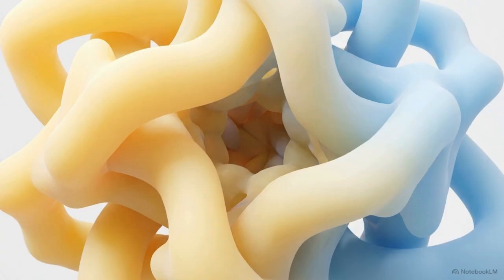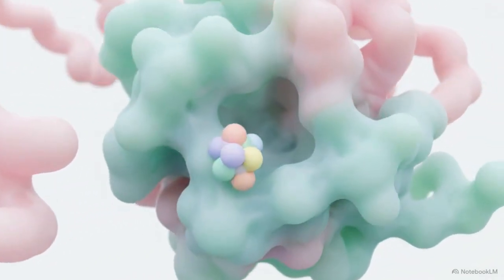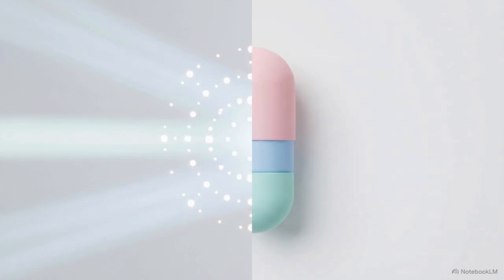By understanding the exact atomic layout of a protein, we can design synthetic molecules shaped to fit specifically into a target pocket, where they lock into place and block the disease. By translating these scattered biological signals into atomic coordinates, we can manipulate the machinery of life with enough precision to fight disease at its source.